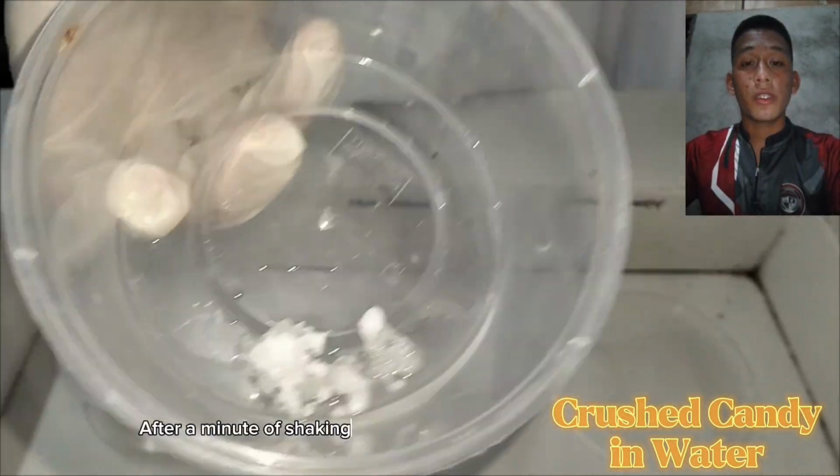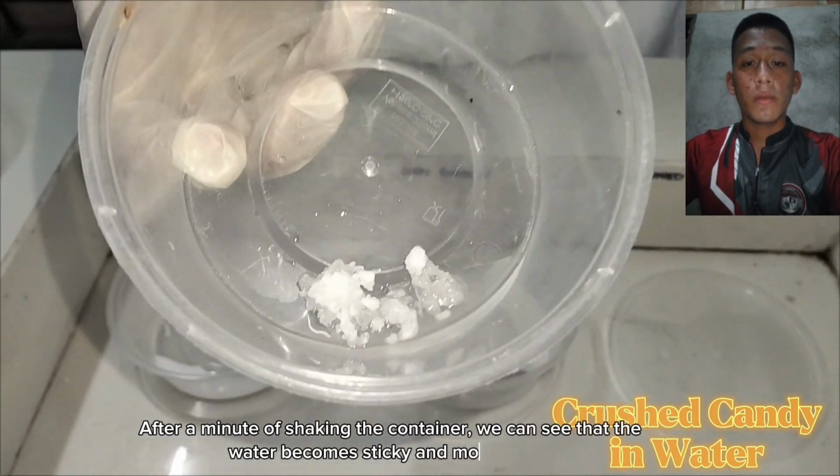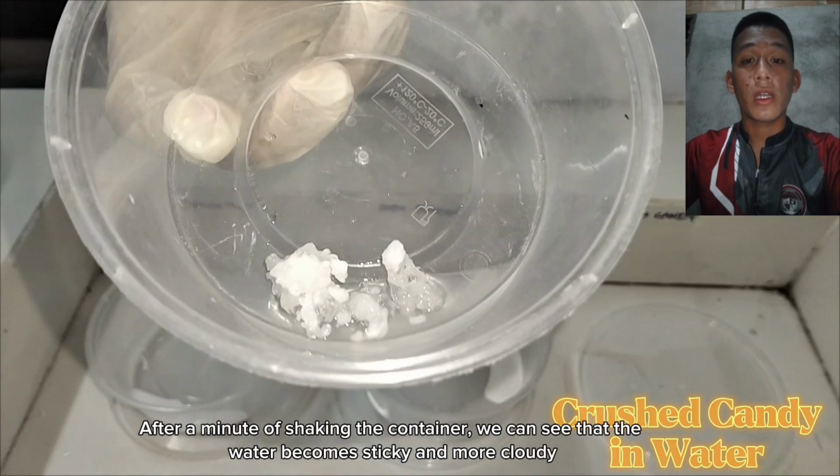After 1 minute of shaking the container, we can see that the water becomes sticky and more cloudy.